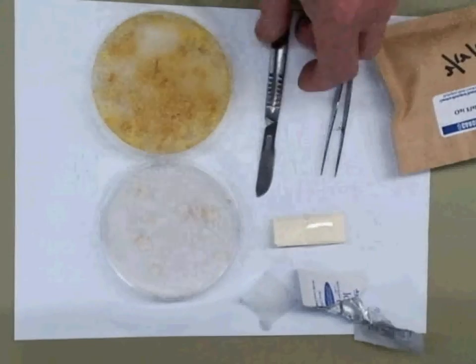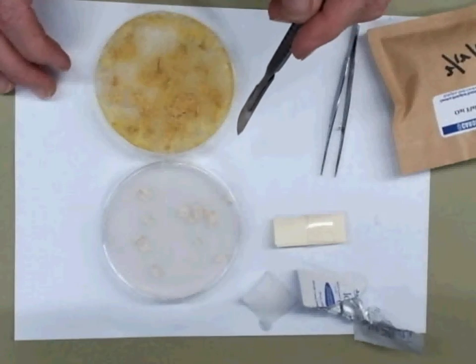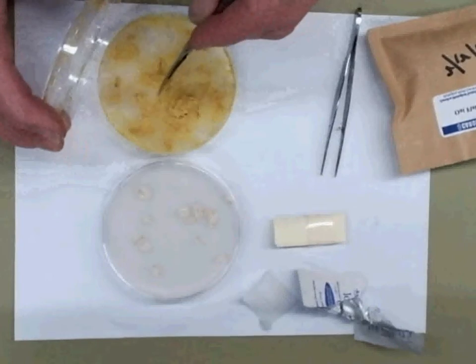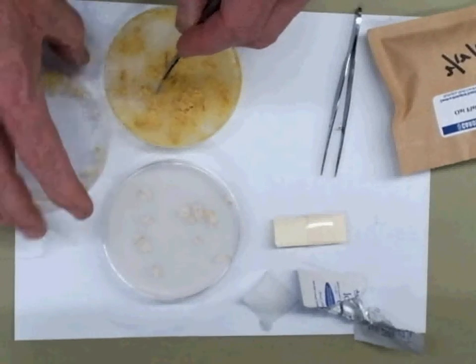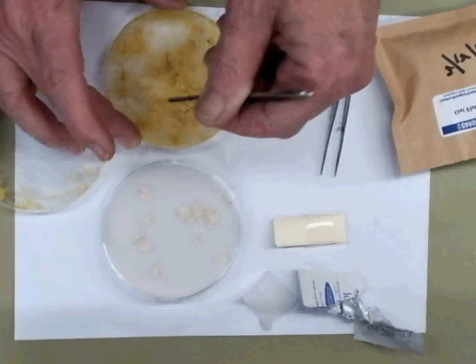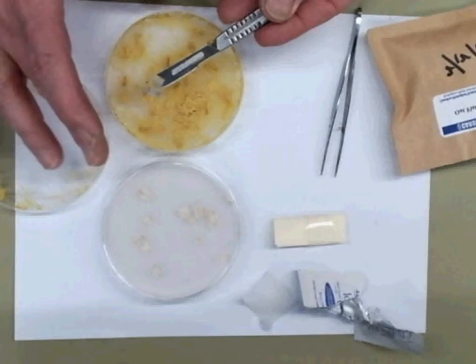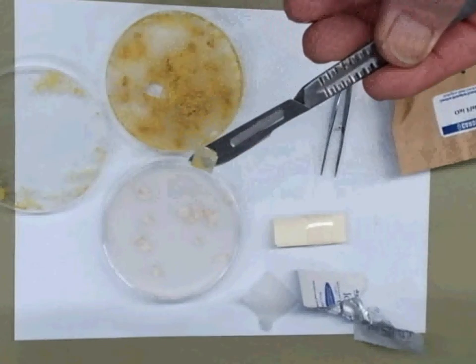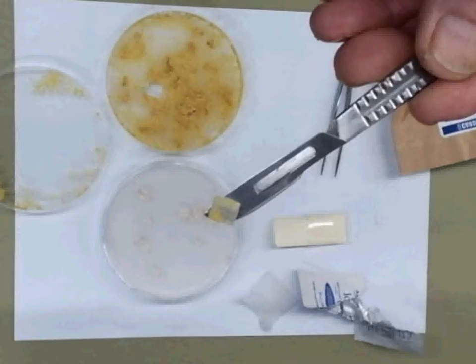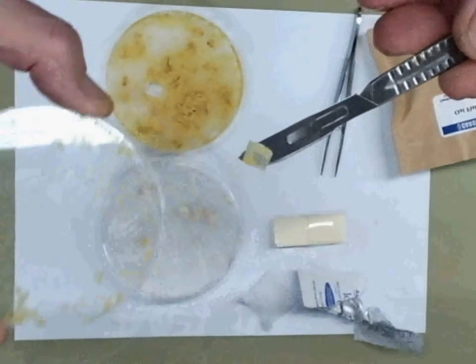Now I'm going to chunk. I'm going to take my sterile scalpel and cut a one centimeter by one centimeter square right out of the middle of the Plasmodium, right there. I don't need any of the oat flakes — there is the Plasmodium I'm going to be taking from. Cover this up — you can see this Plasmodium covering the plastic.